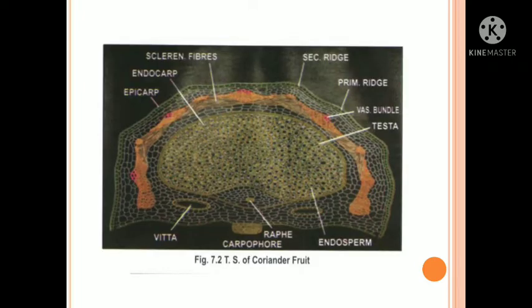In this way, we are taking the section of Coriander. After taking the transparent section, stain, mount, and observe under the microscope. This covers the cutting technique, staining technique, and mounting technique for Coriander. Thank you.